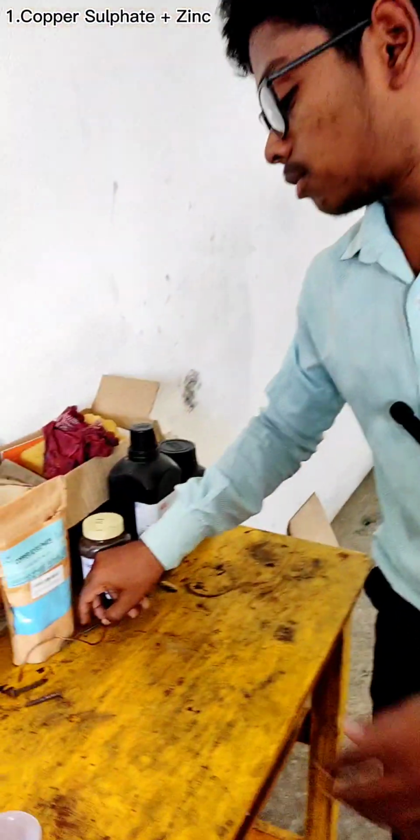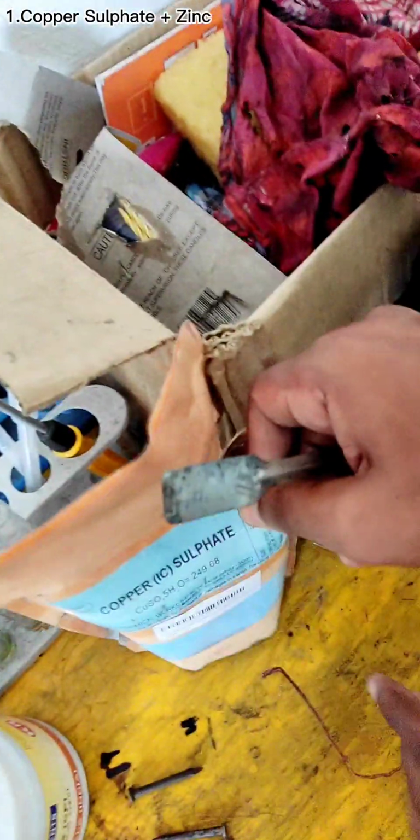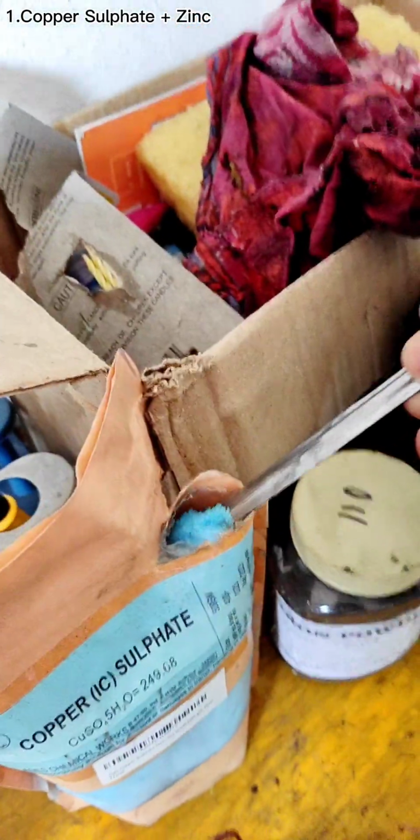So first of all, we will perform copper sulphate plus zinc, that is ZnSO4 plus Cu. In this reaction we will see how Zn displaces Cu. So I am taking first of all copper sulphate, 1 to 2 spatula of copper sulphate in a beaker.